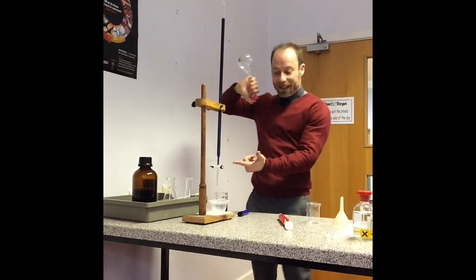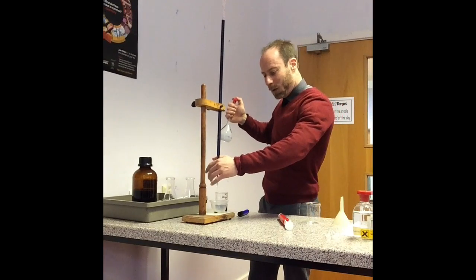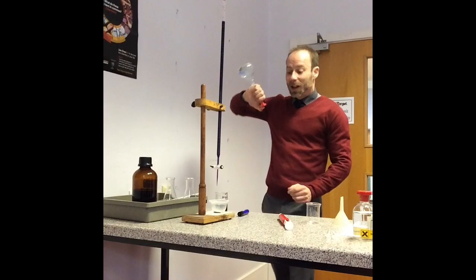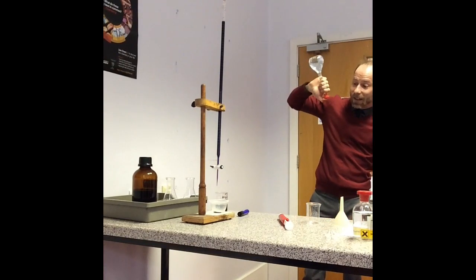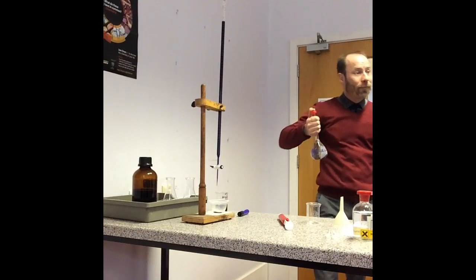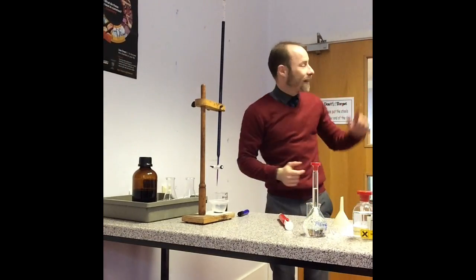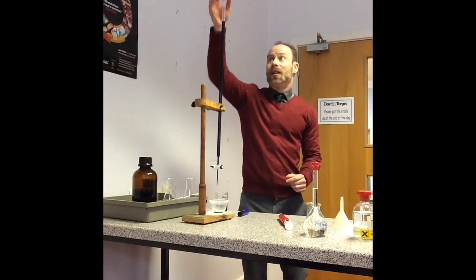While that's doing, obviously need to get the air out, so let's hope this burette actually works. Oh, yes, okay. So it's nice and easy to see that there aren't any air bubbles in there. What is that again? That's potassium manganate solution. So that's the MnO4 minus that I'm going to be adding.